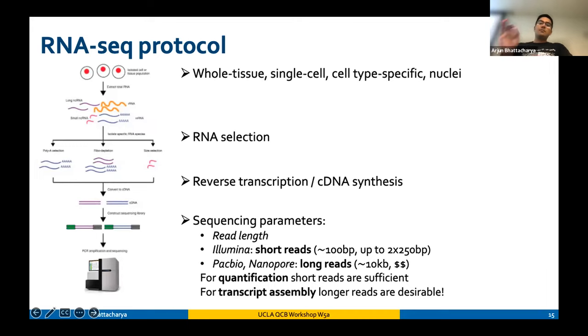Obviously PCR can target single genes. That's one way of quantifying the expression of a single gene. But you can also target groups of genes you're interested in through a targeted RNA sequencing panel. Something people use in a lot of clinical settings is a nanostring chip. Essentially it's a probe set of hundreds of genes instead of tens of thousands of genes in the transcriptome. If you're interested in, say, only immune genes, you can select a probe set that has 300 immune-related genes and assay only the expression of those. So it's a little bit like a microarray, but also a little bit like RNA sequencing, and it brings different kinds of data problems as well.